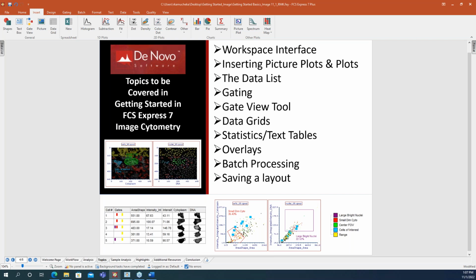The main principles of flow cytometry and image cytometry overlap in many areas, such as taking multi-channel fluorescence data and plotting that data in scatter plots and histograms, looking for statistically significant differences and changes. And now that we can do this with image data, it can give you a step up.